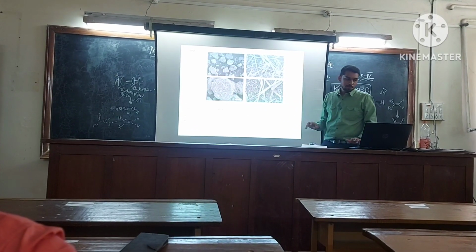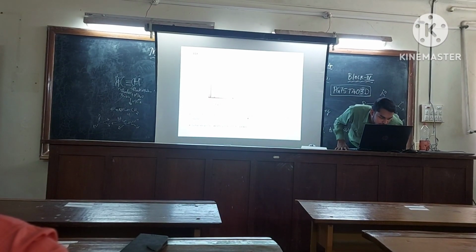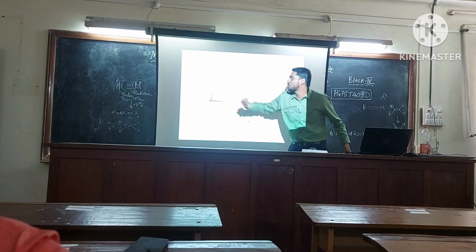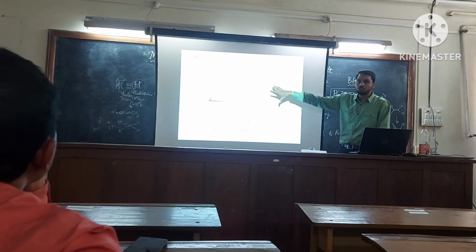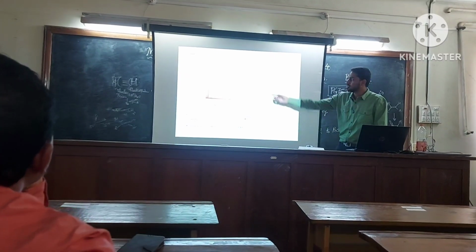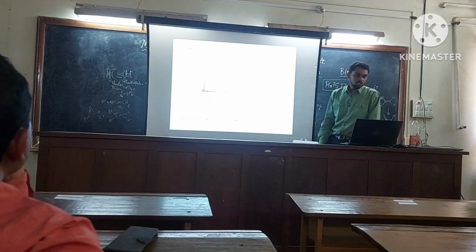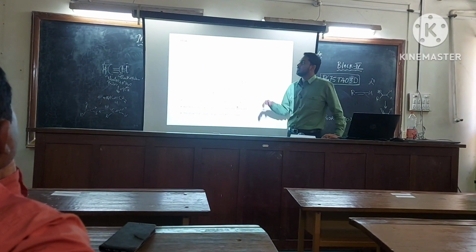Because of that, we are getting the sodium peak, and it is around 0.7 somewhere. So this is the sodium peak. By this we can say that our compound, whatever nanoparticles we have got, contains carbon, oxygen, copper, and sodium.